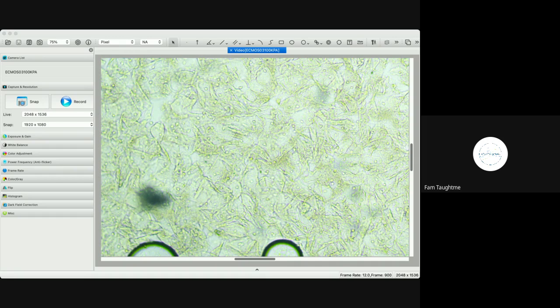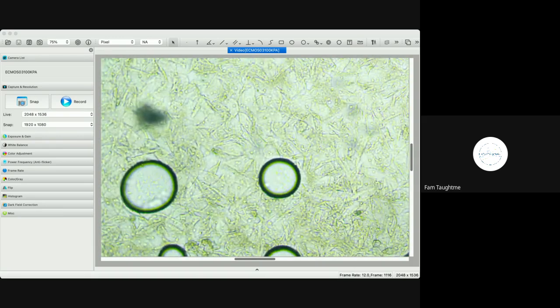Some scientists use a little suction to suck the fluid right out of the cervical crypt, but obviously I'm just grabbing it from physical. So you're getting a lot of vaginal cells in here as well. That's mainly what you're seeing here.